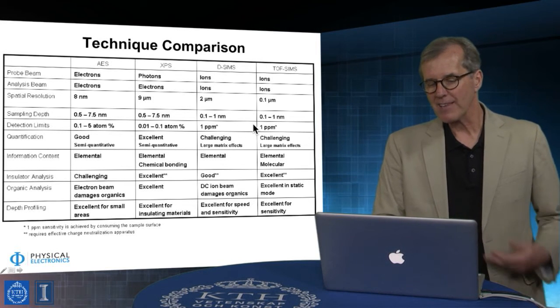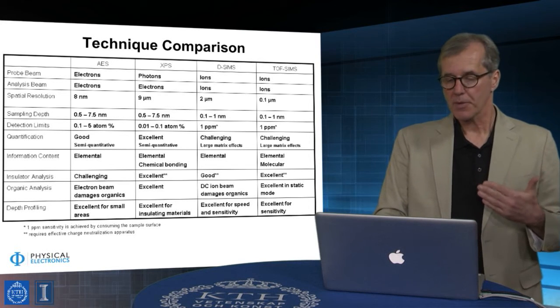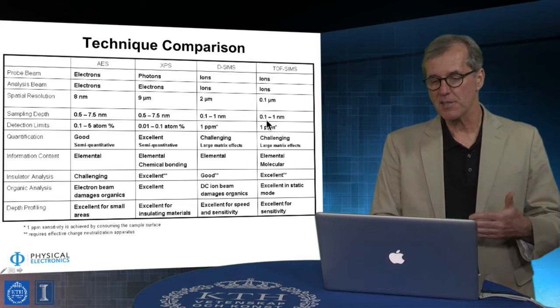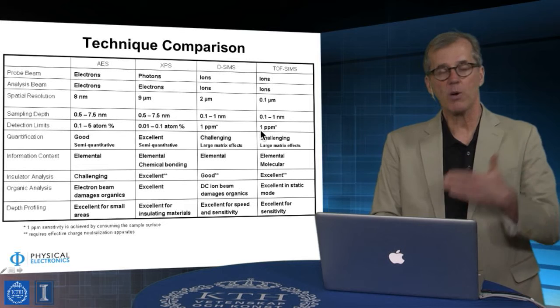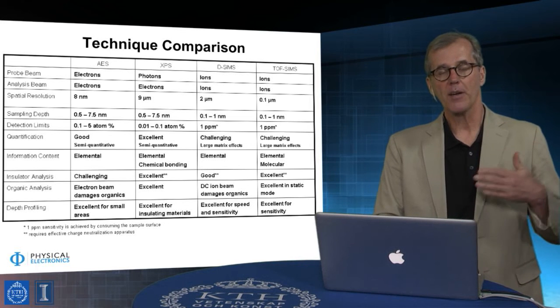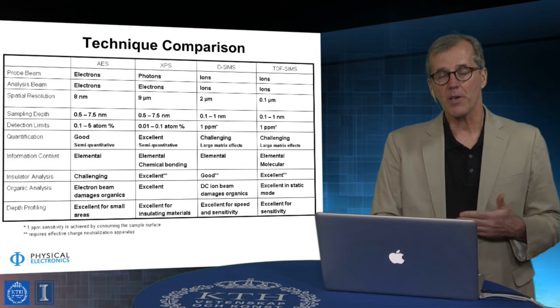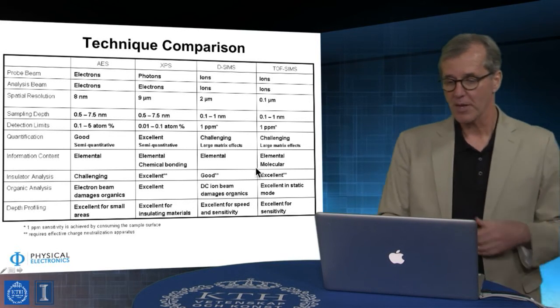And in point of fact, it can actually even be much better than that. And part of the interesting and challenging aspects of this, if you go to these extremes of analytical sensitivity, is the question of how do you construct appropriate calibration tools to characterize information at such challenging levels of analytical sensitivity.